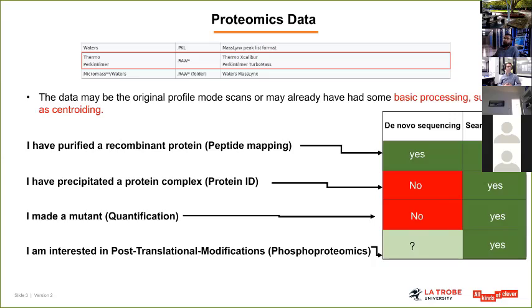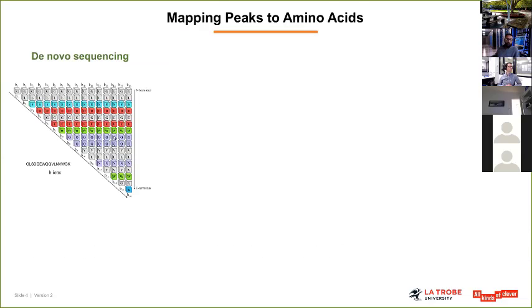In de novo peptide sequencing, it's a bit like sequencing your gene, like DNA sequencing. Instead of looking at the ATGC, we just look at what's the difference in the mass compared to the original mass of the peptide. As the fragmentation goes on, individual fragments break off, and we can actually work out from the fragments what might be the full sequence of that peptide.